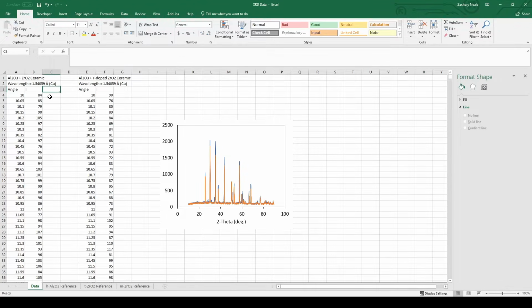So to do that, we can add a number to the intensity values. So we'll make a new column here called iShift. We'll have a number to add the intensity to. We'll start with 100. So this first value, make a formula that says equals this value, the intensity value, plus this shift value. You say enter. If you click on the cell and double click on the bottom right hand corner, it will automatically populate that formula for the remainder of the column like that.